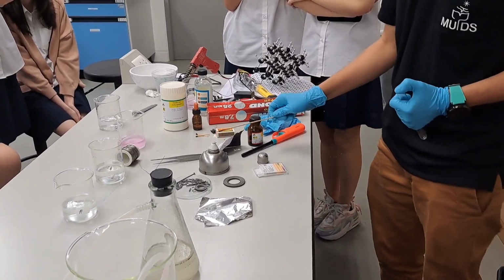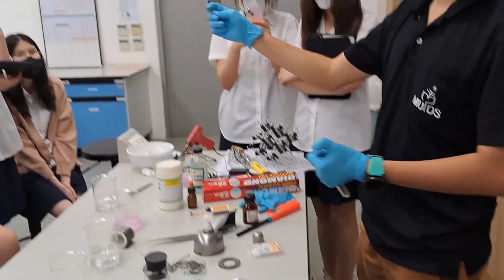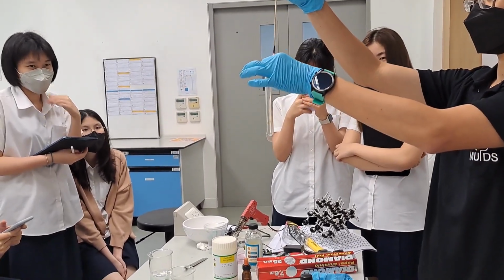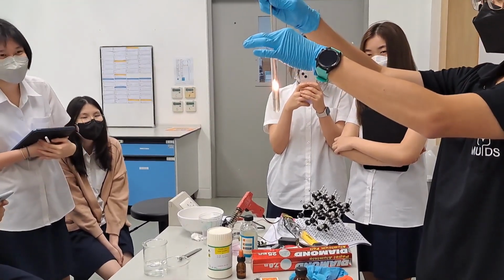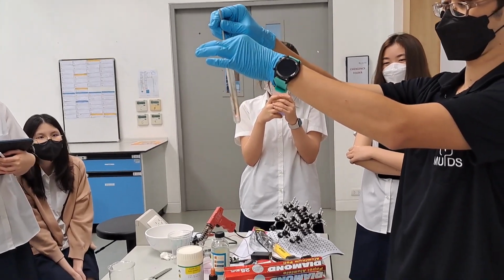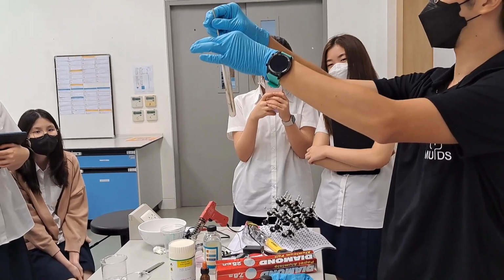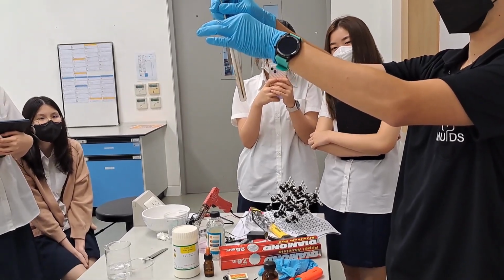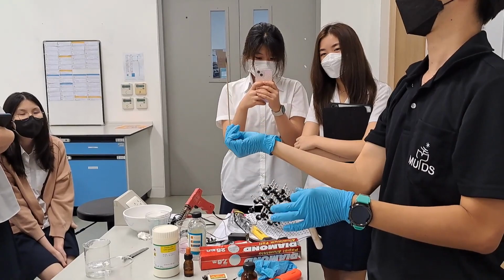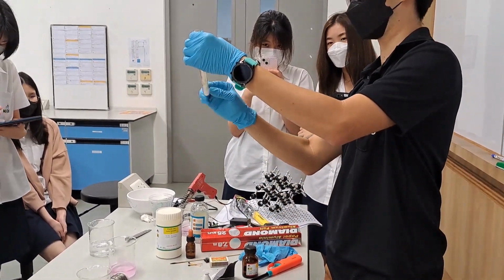Let's do it again, without fire, just the lit-up stick. 1, 2, 3. Boom. Okay, alright. Once the oxygen ran out, only carbon dioxide was there. So this one extinguished. And the smoke inside here is carbon dioxide.